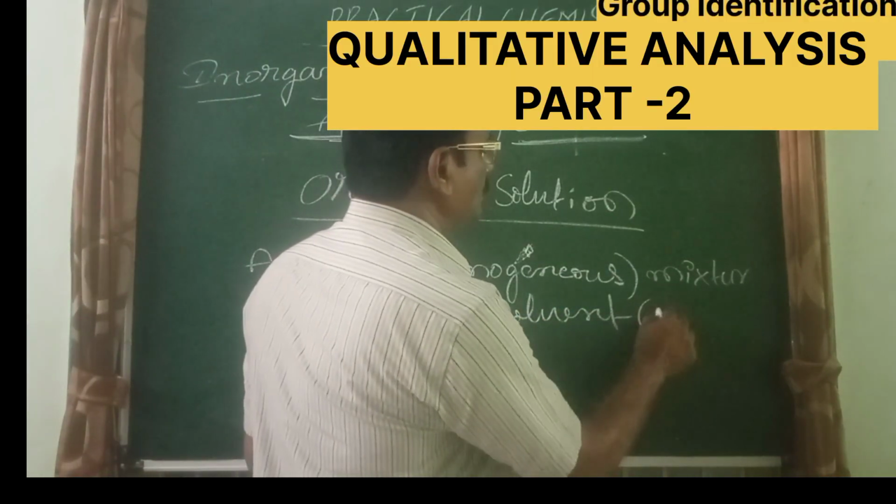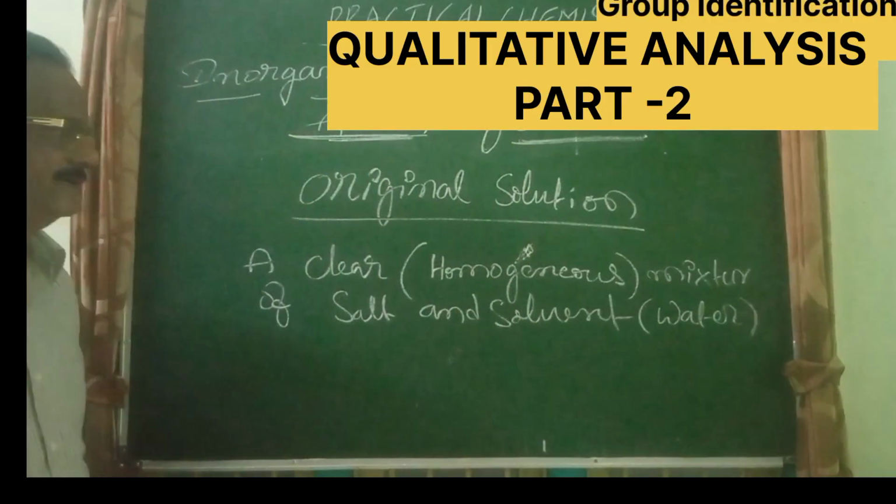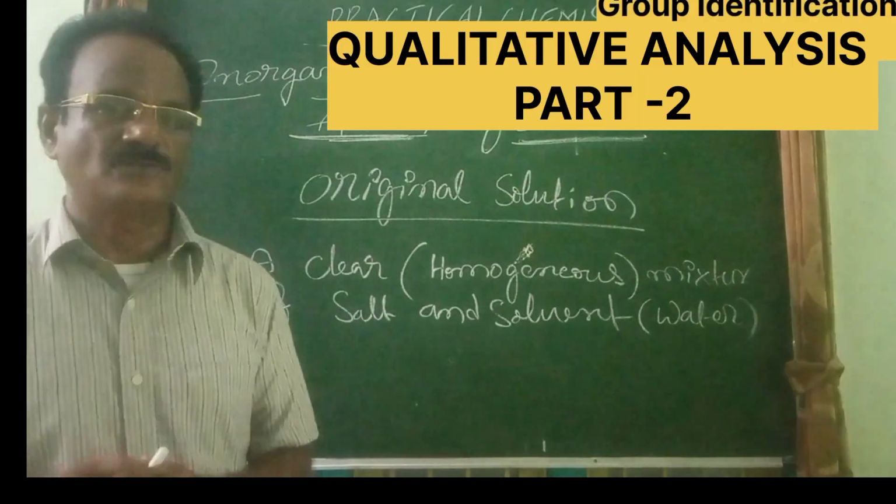Usually water is used as the solvent. Such a solution is called an original solution.